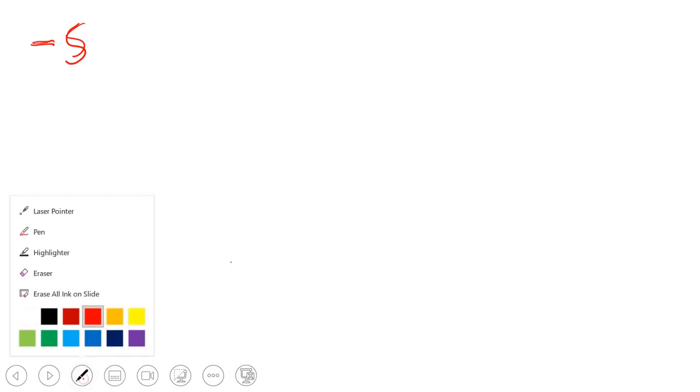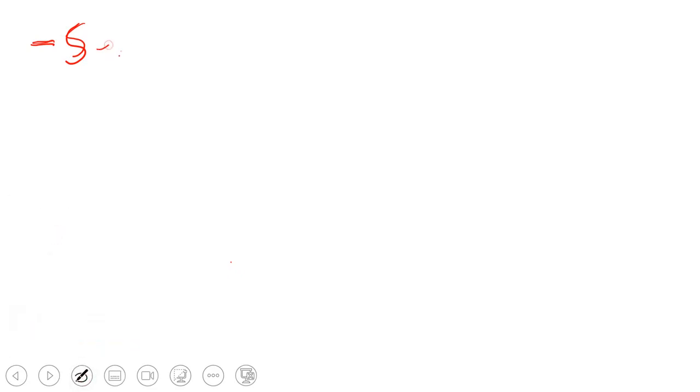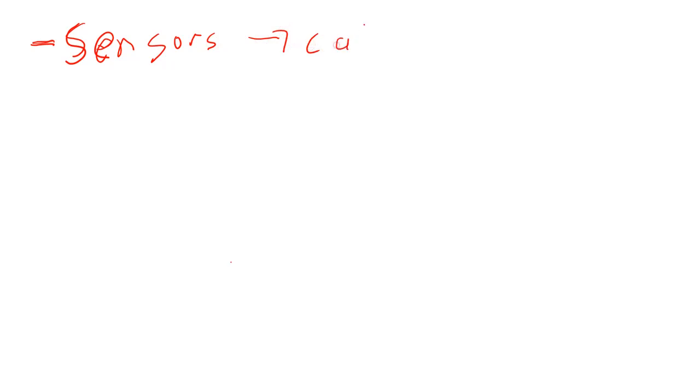So once you plug your pH meter into the LabQuest, you're going to go to Sensors, and you're going to click on Calibrate.